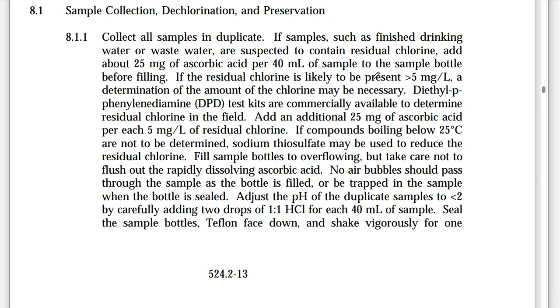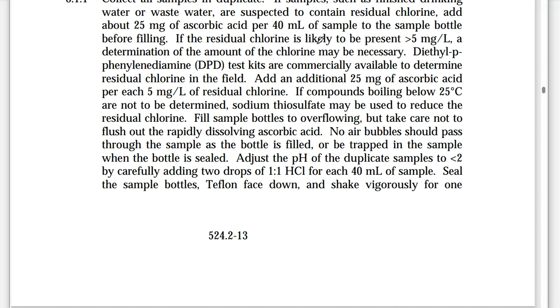So again, this is part of the SOP, it's part of the field directions, and this is what the field collector would follow when they would go out and sample or collect these particular soil, water, air, before they bring it back into the lab. And for this particular method, it's all about water, wastewater, okay?